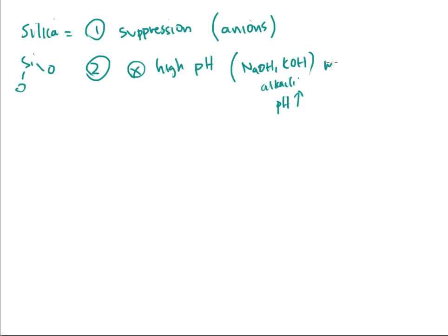And this mobile phase is constantly pushed through the silica of the column. That means over a course of time, this thing will slowly decompose, little bit by little bit by little bit. So the amount of your stationary phase will begin to change over a course of time because you're dissolving it.